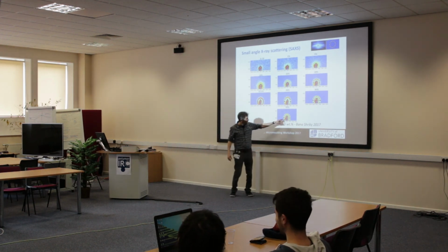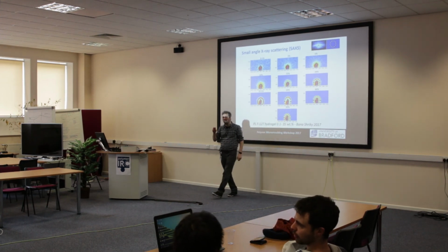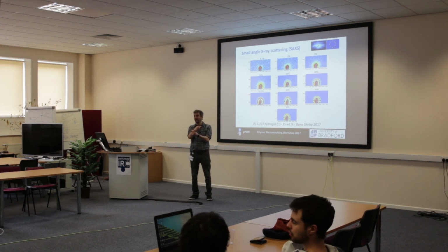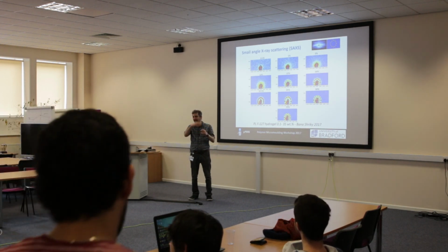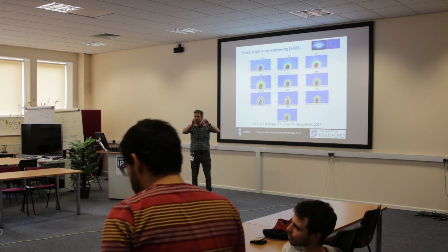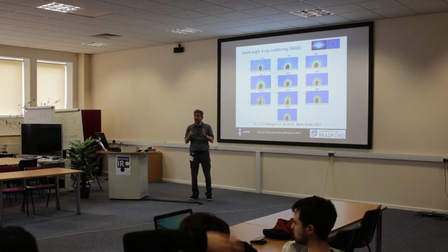We actually put a beam stop in here. So this blue thing here is actually a beam stop. What that stops is all your beam hitting your camera directly. It doesn't damage the detector anymore with CCDs, it's fine, except it kind of floods. You get this parasitic image, like ghosting, on your camera.